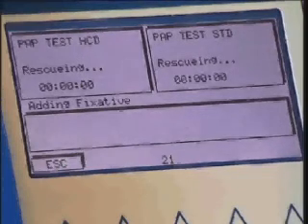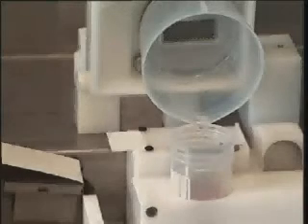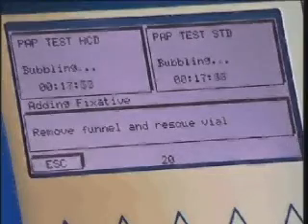After aspiration, the unused part of the samples is transferred back into the sample vials. The processor then requests the operator to take the sample vials away.